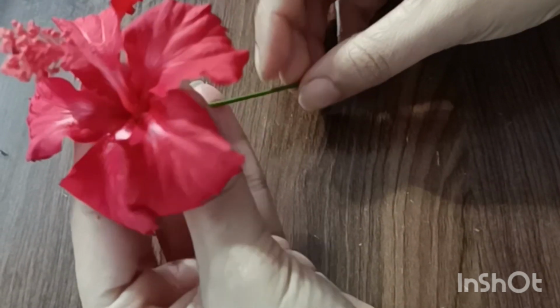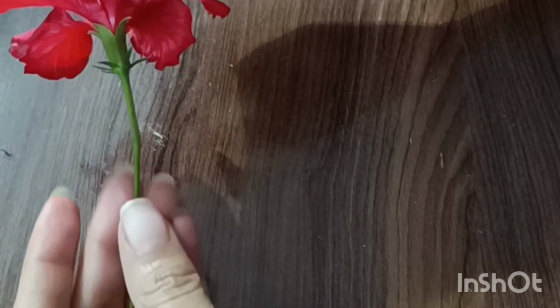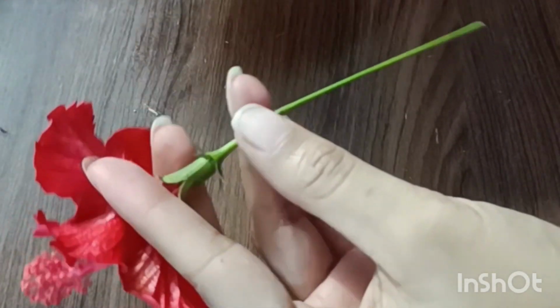The hibiscus flower is large and attractive, bisexual, containing both male and female parts. It is a complete flower, actinomorphic, meaning it is radially symmetrical, and pentamerous, meaning floral parts are in multiples of 5.